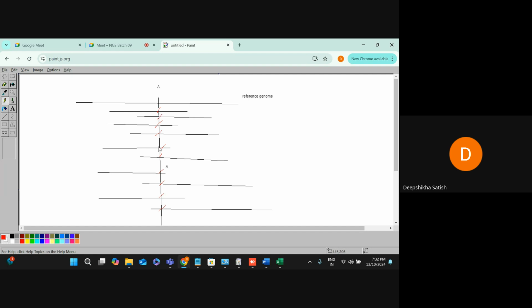So there are 10 times this adenine was read, right? So for this particular read, what is my depth here? 10x. Why 10x? Because adenine was read 10 times by the sequencing machine. Okay? Are you getting this depth?